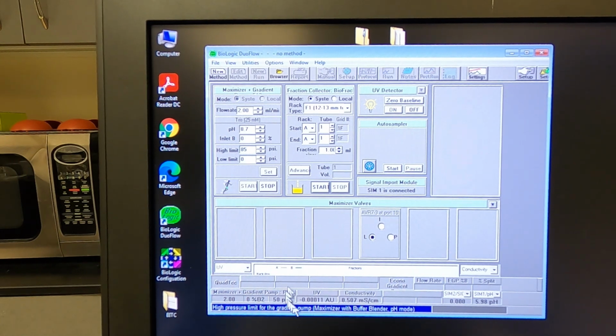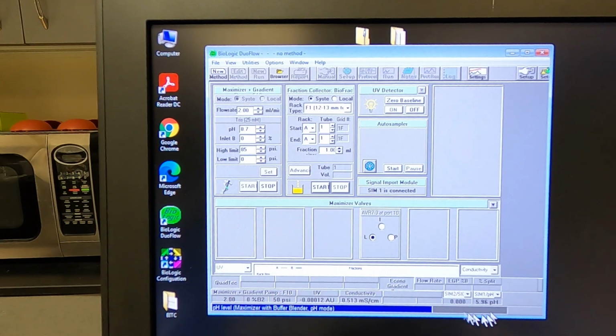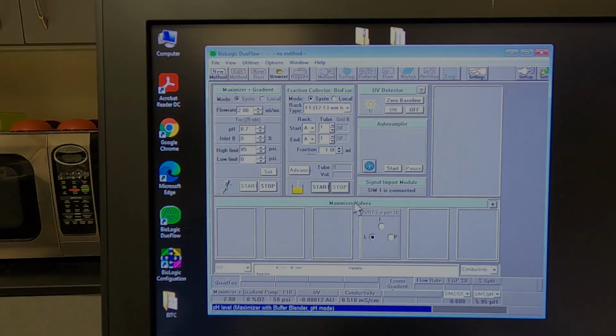And then we also see here the live reading for the UV. So we're right now just pumping water through it, so we don't have anything absorbing. It's also been zeroed. And here you'll see a live value for your conductivity, so 0.512 millisiemens per centimeter. And at the far right, we have our current pH reading. So it's giving you an uncalibrated reading currently. But once you add your buffers in, and the pH meter has been calibrated, you'll see that it should match what your setting is.